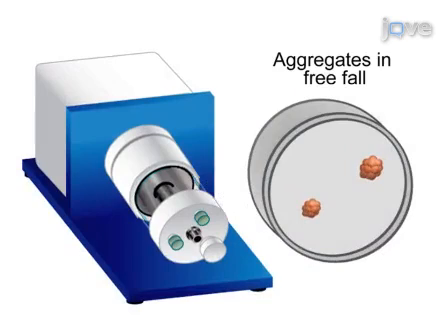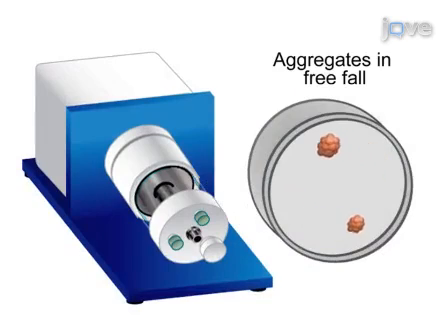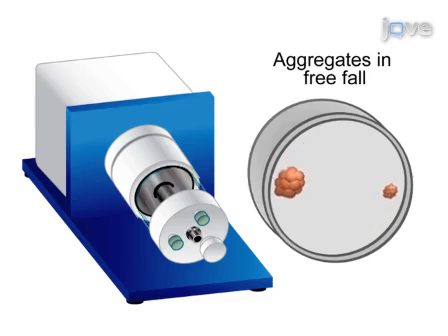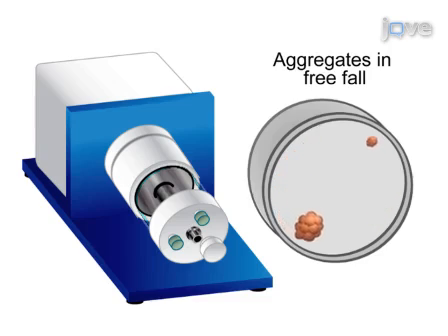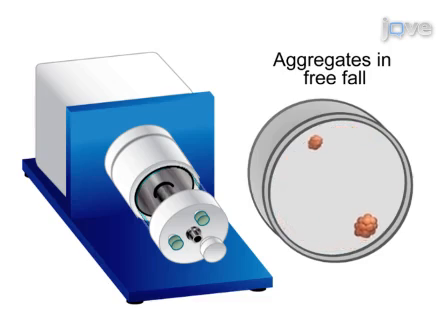Rotate the STLV on the platform to create a constant freefall environment of low-fluid shear, allowing the cells to attach and grow on the beads and form cellular aggregates.